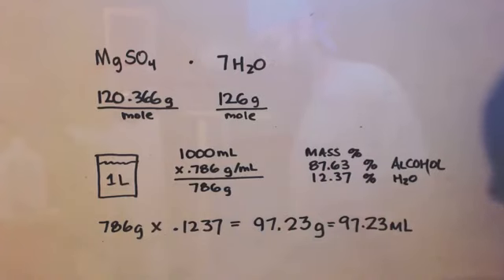I'd let it stir, let it sit for a while and stir, and the next day I would distill. I'd filter out the stuff, and then I would distill my alcohol, and that way I would have pure anhydrous isopropanol, 2-propanol, propan-2-ol, whatever you want to call it.